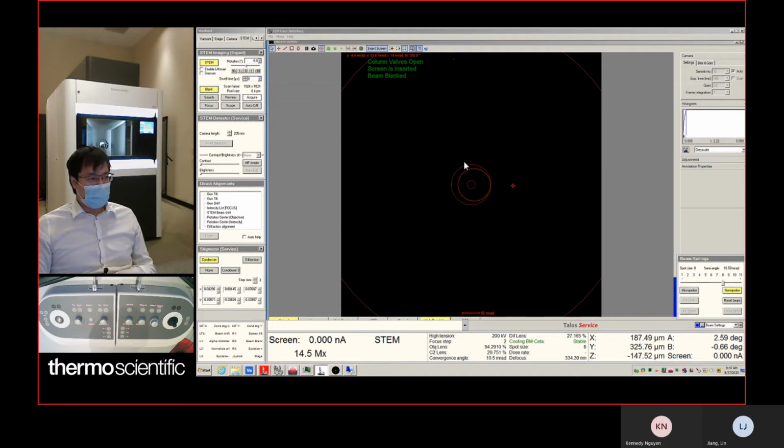So if you're perfectly on zone, you can see the largest gap between atoms. If you're not perfectly on zone, the gap becomes small, and the signal collected changes.